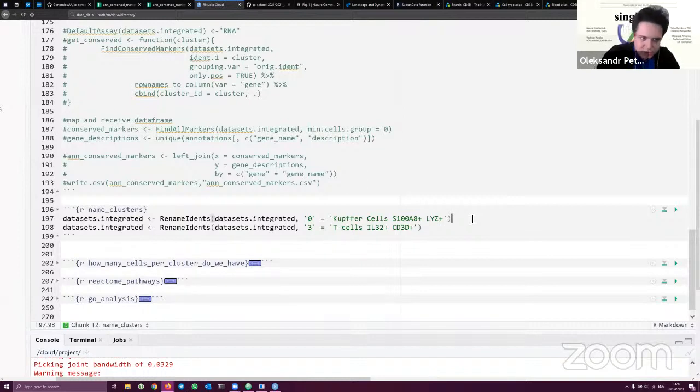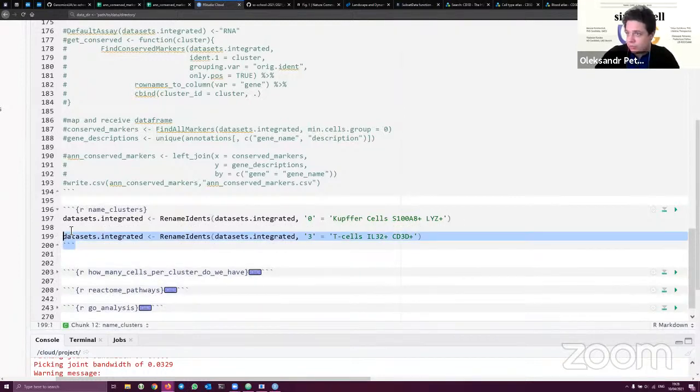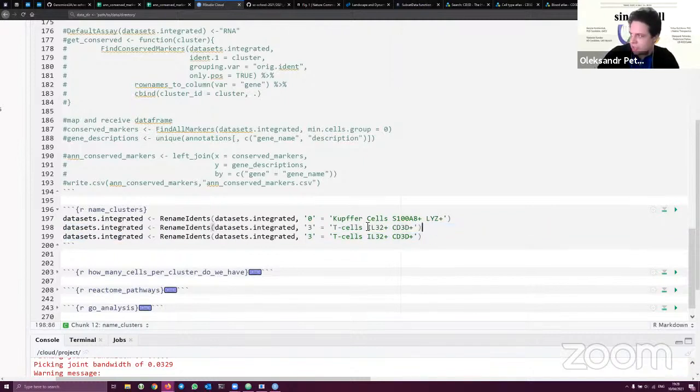So Muhebat writes that cluster number 2 is probably the T cells as well. Muhebat, do you have any opinion about these T cells? Are they any specific T cells, or maybe have specific markers? Or you Google. Feel free to unmute yourself if you can, so it will be easier for us to hear. Or if you don't know, we can actually check.